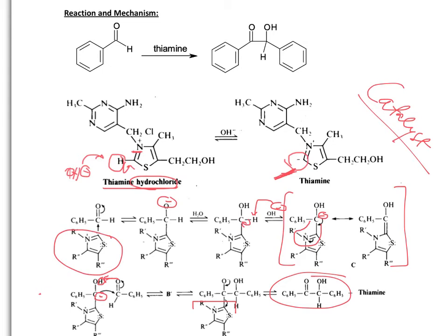It's difficult to go wrong here, but in the past I have seen that if you added the sodium hydroxide too quickly, and the final solution starts looking like a caramelized sugar brown, there's a problem. As long as you see a golden brown, you should be fine.